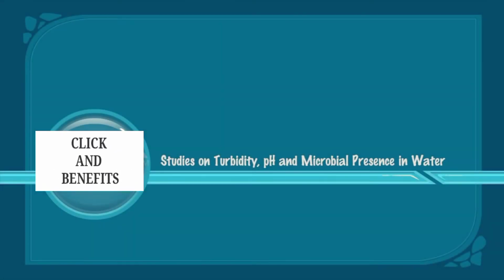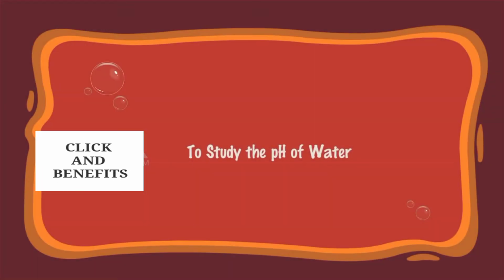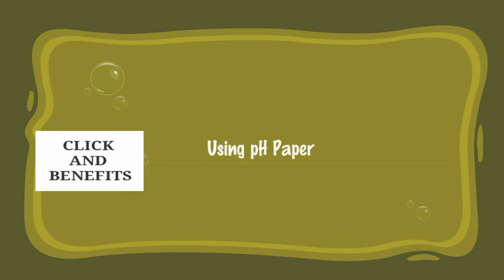Studies on turbidity, pH and microbial presence in water. To study the pH of water, using pH paper.